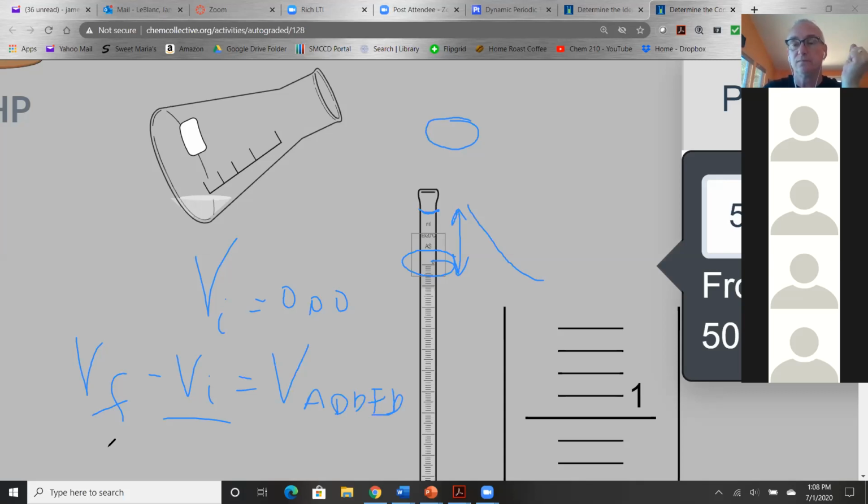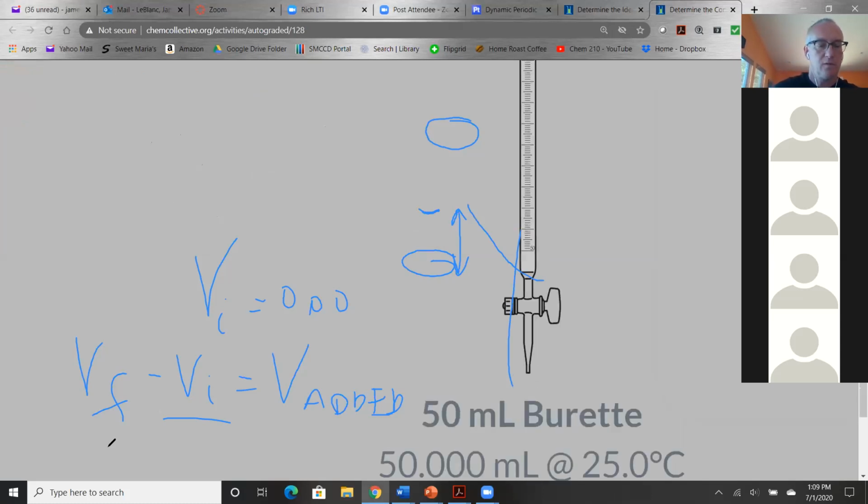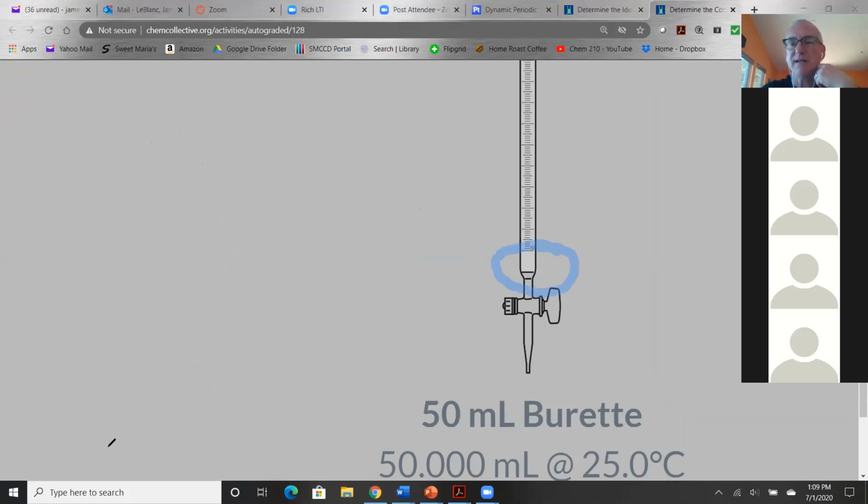So my other question is, if you put in 50 mL to a 50 mL burette, how did you end up with 2 mL initial? Oh, because, here, let me show you. At the bottom of the burette down here, there's some dead space. Notice that? Right there, there's some dead space. You want to have a little bit of dead space there because you don't want it going to 50 and then stopping, and you completely run out of liquid. You want to give yourself a little leeway so that when you get down to 50, you say, oh, I need to add more solution.